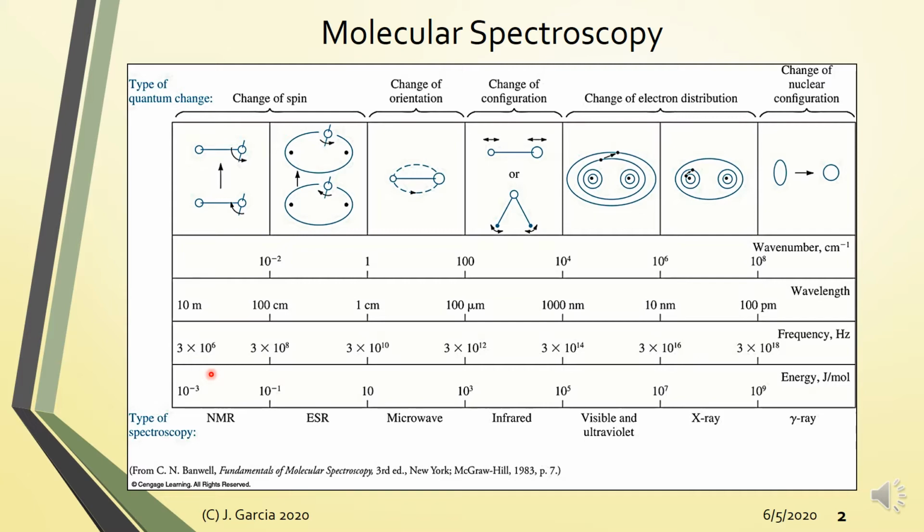What it does is that it changes the spin of the nucleus, yung kung proton NMR yan or carbon 13 NMR, yung spin ng nucleus, but take note between a chemical bond, so kailangan bonded yung ating particular atom of interest.